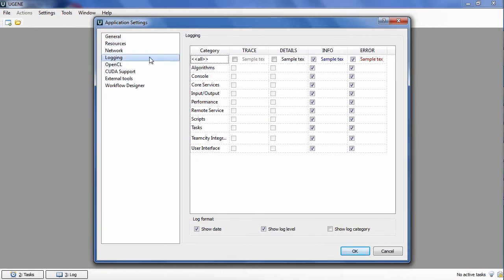Logging settings were enhanced. Customize which messages you would like to receive with ease.